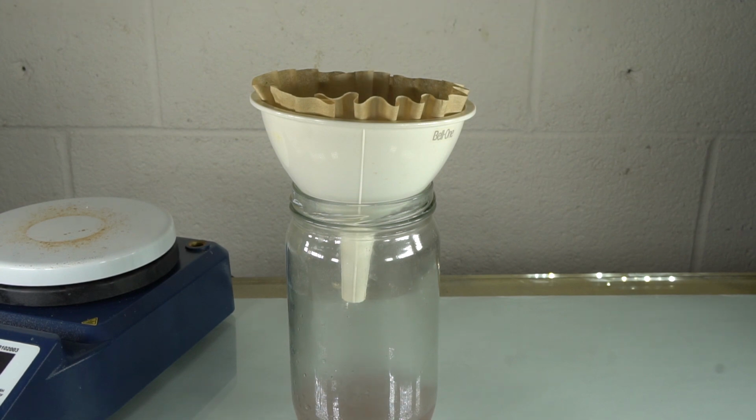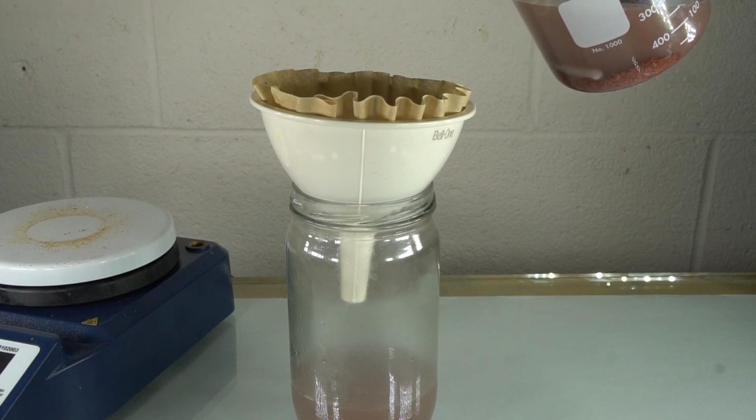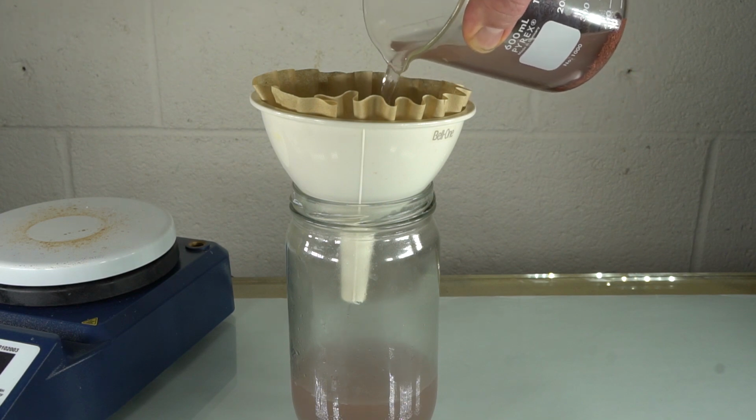Wait till that goes through. The copper metal, because it's going to be in powder form, it's very reactive. It's going to be great for reacting with vinegar. It's going to be great with reacting with hydrochloric acid. Both of those reactions need some hydrogen peroxide to help them along, but really nice reactions. And I also want to see how nitric acid works on copper powder versus, say, a copper penny.